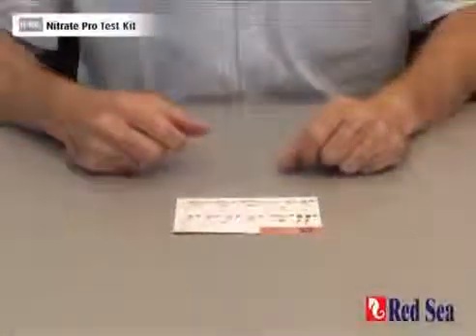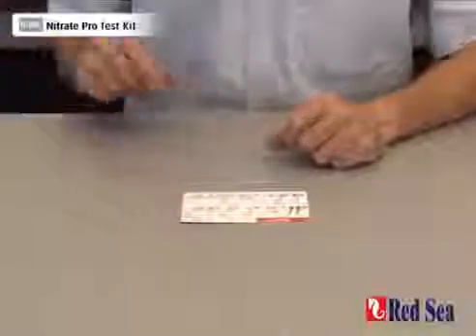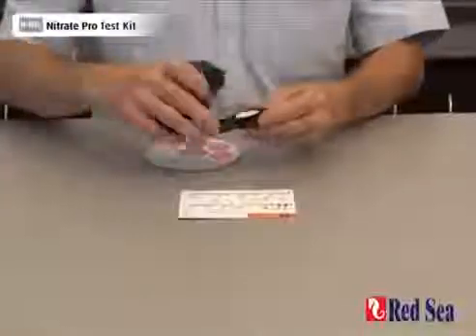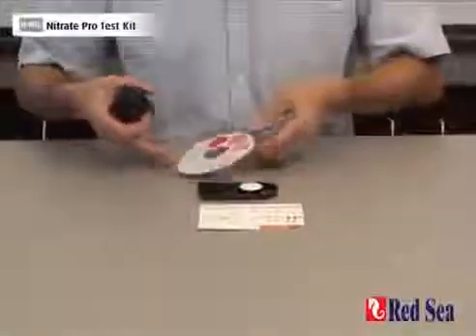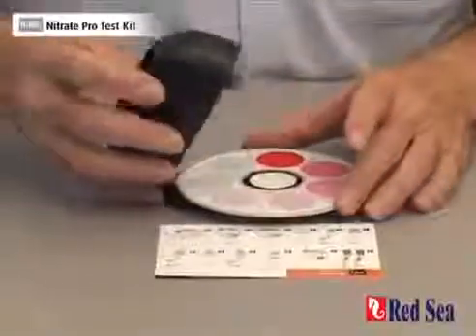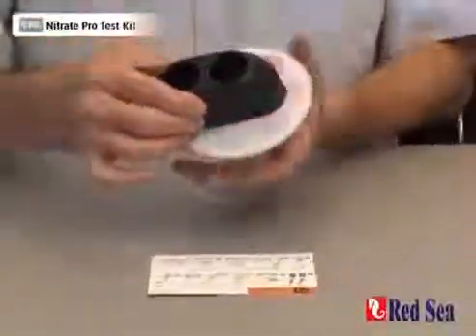Before we can do the nitrate test, we have to assemble the comparator with the nitrate color disc in it. Open up the comparator, place the disc in the center, hinging at the back. Pop that into position and make sure that it rotates easily.